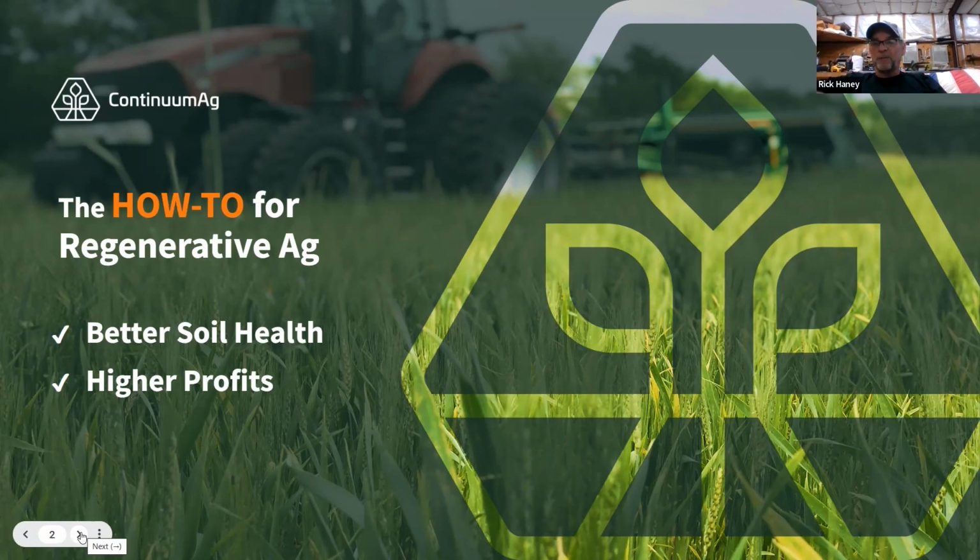That's the valuable part of the Haney test. So just give some thought to what samples you want to pull, and what you want to try to get out of it and understand. And the more different they are, the better it'll help us understand what's going on.